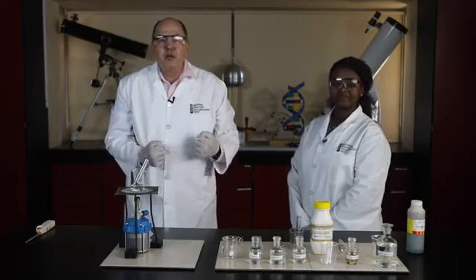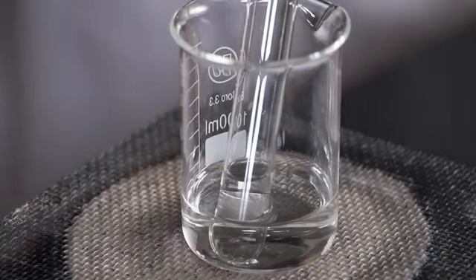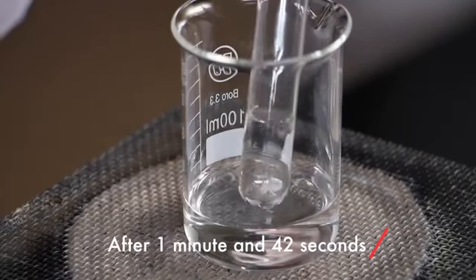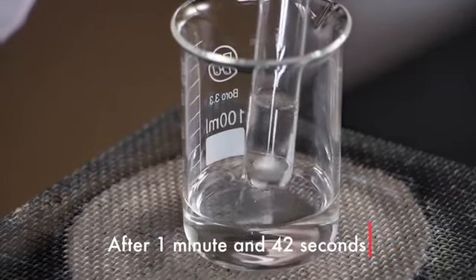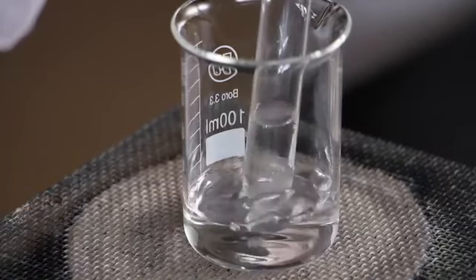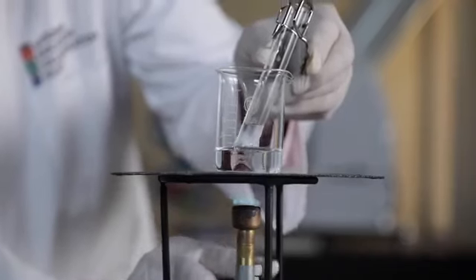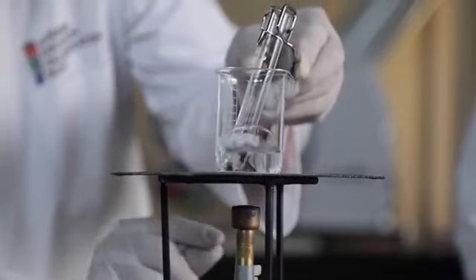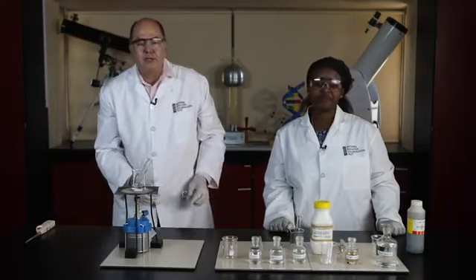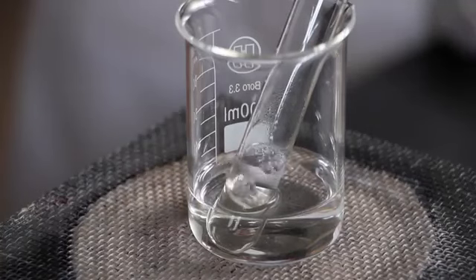Now we put the beaker on the gauze mat and we heat the water until it boils. We're getting some bubbles inside the reaction vessel. And the water looks like it's almost boiling. There we go. Water's boiling. I'm turning off the Bunsen flame. I'm going to let it cool down for a minute while it stands on the gauze mat here. The reaction is going quite nicely.